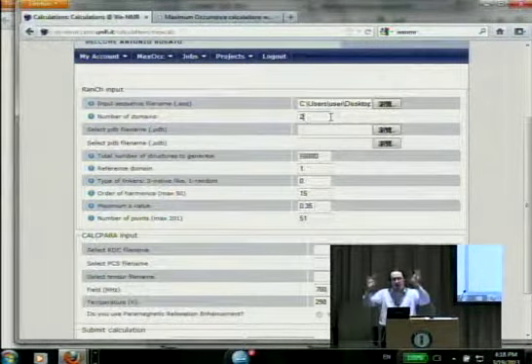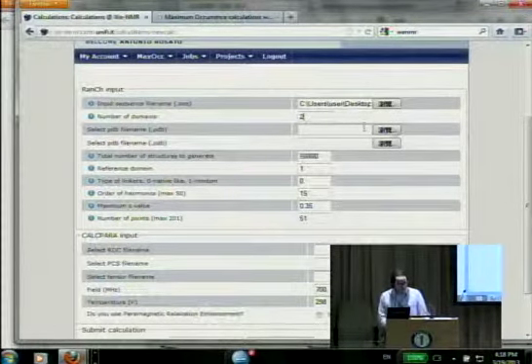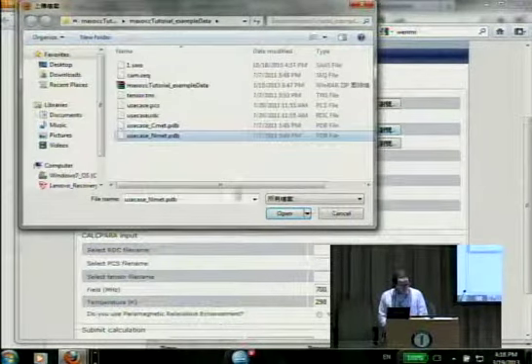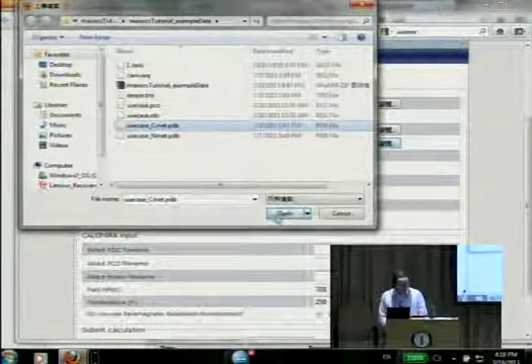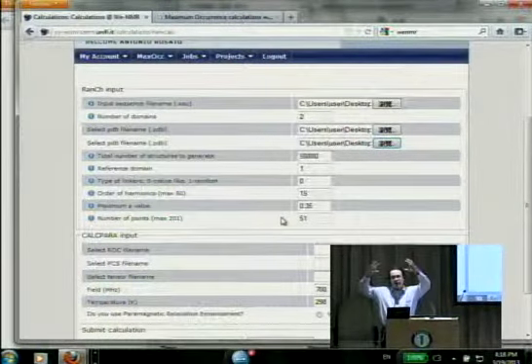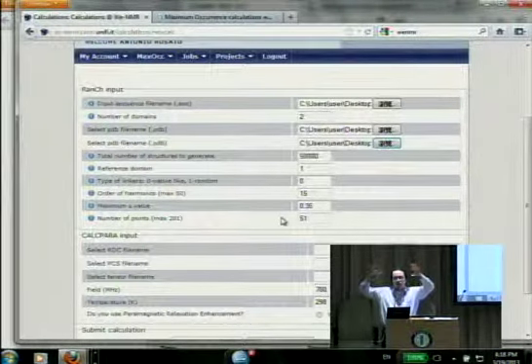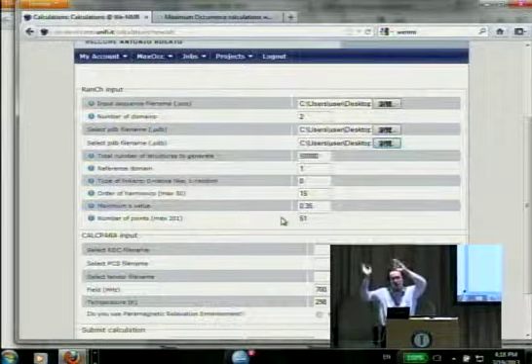Now we are going for 2 domains, and now you have to input the PDB structures of the 2 domains. These are needed because the program will keep these structures fixed, and it actually uses them to compute the pseudocontact shifts and the couplings, and it will move around just the linker region.